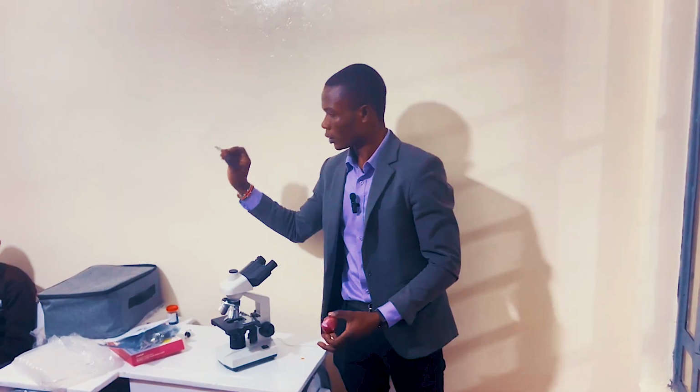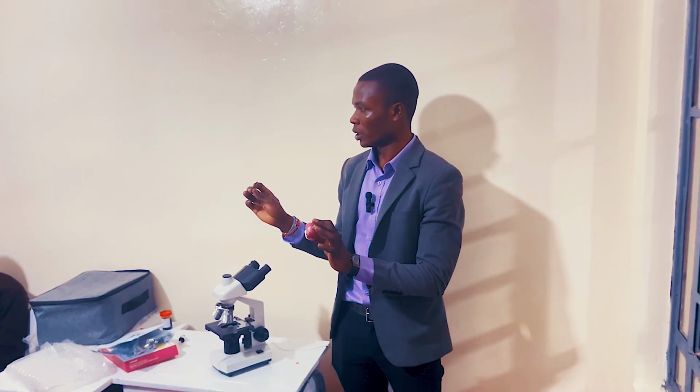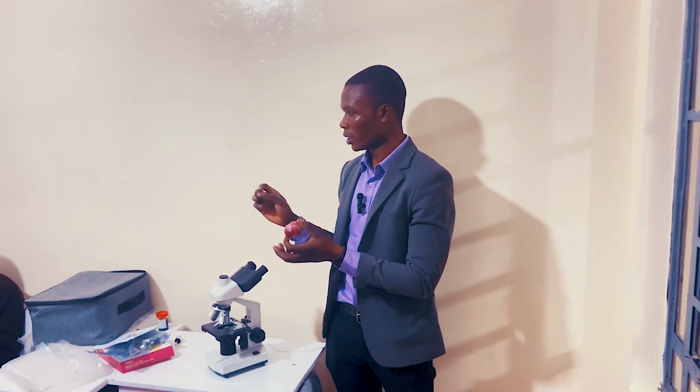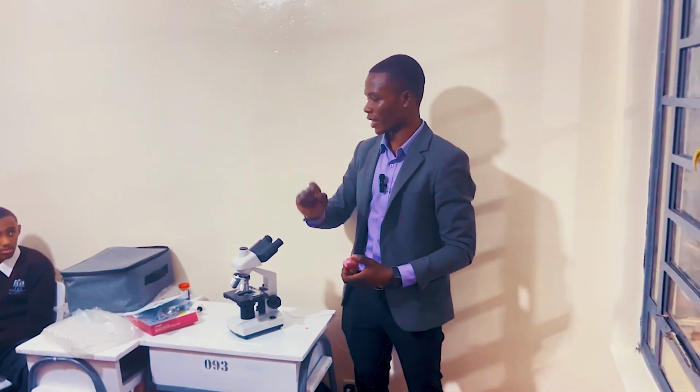A sharp object. It can be a scalpel. We have one here. You can use a razor blade. You can use a very sharp knife to cut it into a very thin section. That's one, thinning. Another one, yes, Halima? Staining. Good. Staining is another one.